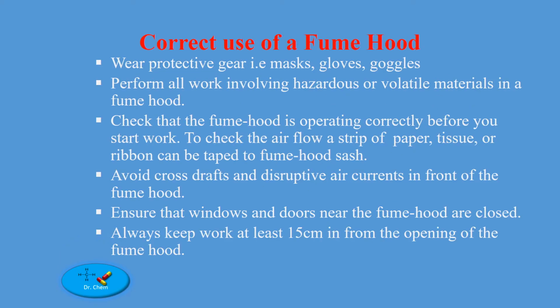Let us go through the correct use of a fume hood. Wear protective gear: masks, gloves, and goggles. Perform all work involving hazardous or volatile material in a fume hood. Check that the fume hood is operating correctly before you start work. To check the airflow, a strip of paper, tissue, or ribbon can be taped to the fume hood sash.